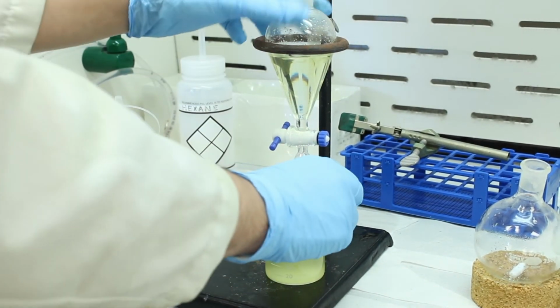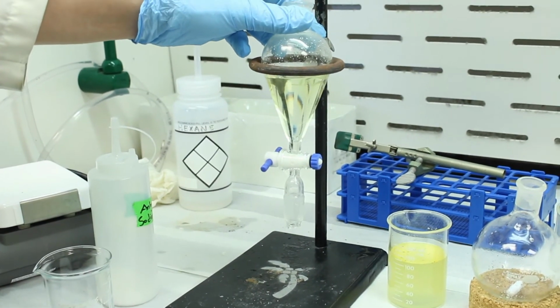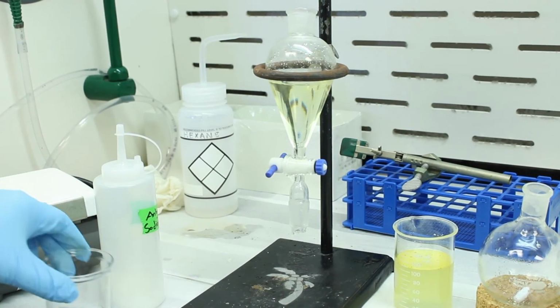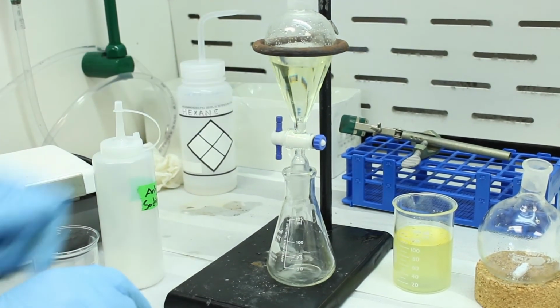Okay, so now we have our product. Our triphenylmethanol should be mostly in the ether here. Okay, and then we're going to add that to an Erlenmeyer flask to dry with sodium sulfate.